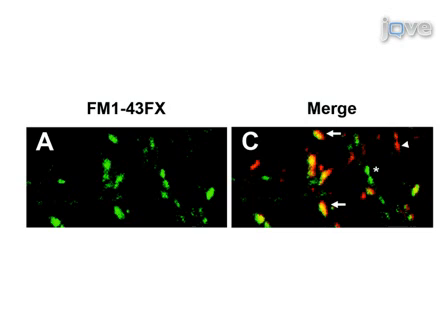A third population of synapses will also be observed. These are positive for green FM1-43 fluorescence, but devoid of red vGlut1 staining. These are active GABAergic synapses, and an example is indicated by the asterisk. These are excluded from most of our analyses, but can be explicitly studied using a vesicular GABA transporter antibody in place of the vGlut1 antibody.